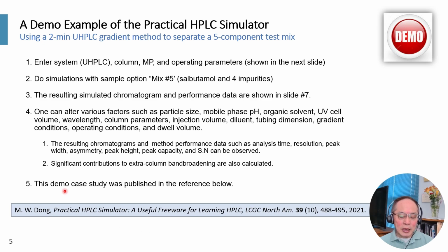Now, this demo case study was also published in 2021. So actually, I published a paper in LCGC magazine, which you can also download for free. It gives you a kind of written version of what you can expect to find out. But I think the best way to learn is actually to watch the live demo, and you can see how easy it is to simulate and use the program. It's very quick.